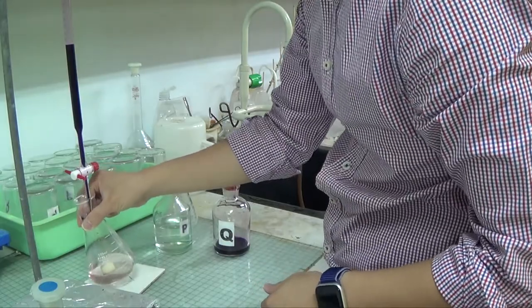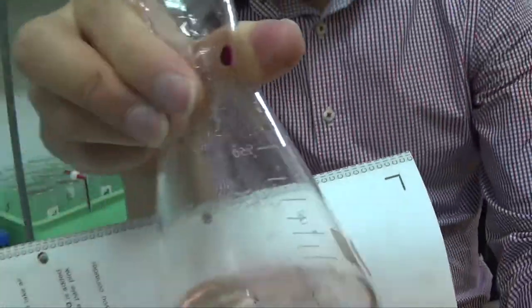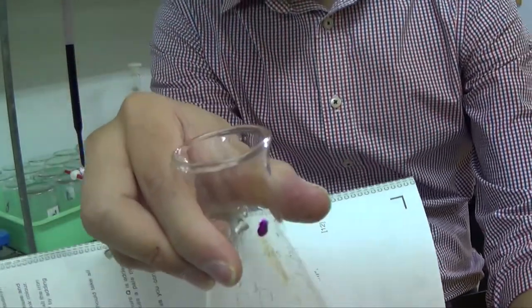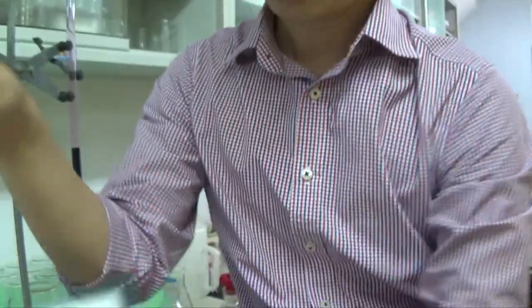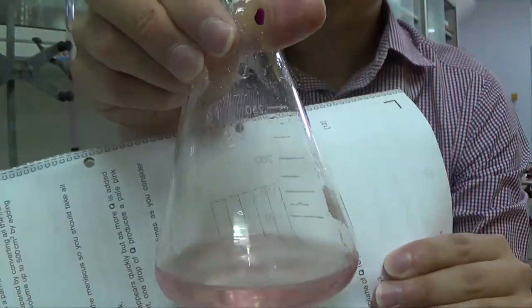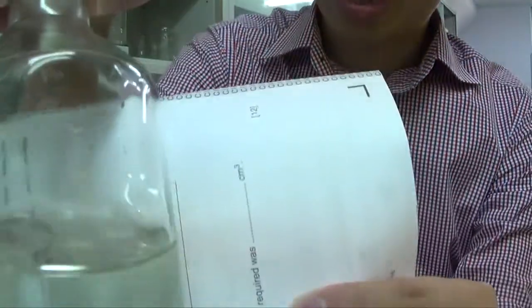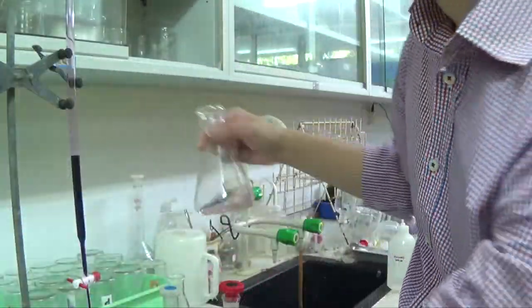Okay, so I've stopped swirling. I hope you can see the color now. The color is a slight pale pink. I better move the camera a little bit up. So the color is now a little bit pale pink and no longer this color. All right, so that was doing drop by drop at the very end.